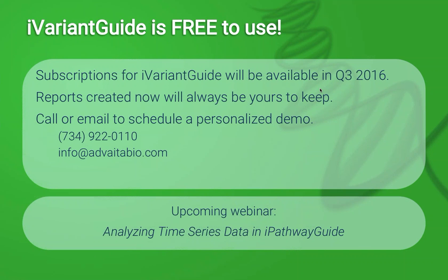The first one we have is, are genomes restricted to human only? Currently, we offer HG19 and HG38 and no other organisms, but we are open to suggestions, so if there's something you desperately want, please reach out.